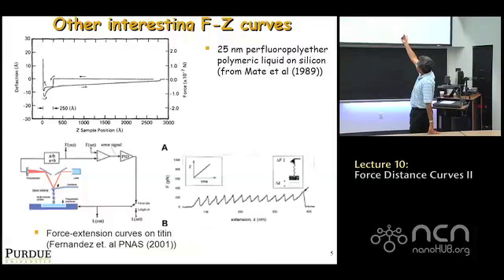What you've got along the y-axis is not the force, but cantilever deflection. But that's okay. To get force, you just multiply cantilever deflection by the stiffness, okay? So effectively, the y-axis is the force. So you've got force Fz. Try to interpret that for me, if you will.